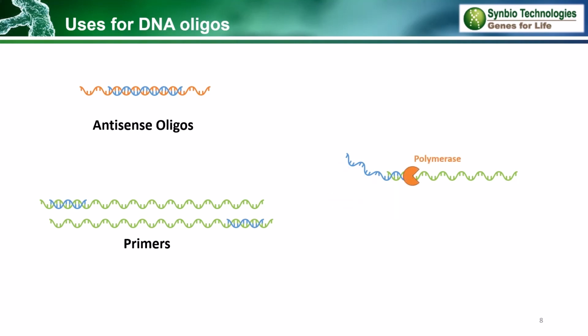The polymerase then binds and synthesizes the antisense strand, and the cycle can repeat itself with a reverse primer and then completes the DNA synthesis. You can now see that the DNA strand is longer and incorporates the overhang region.